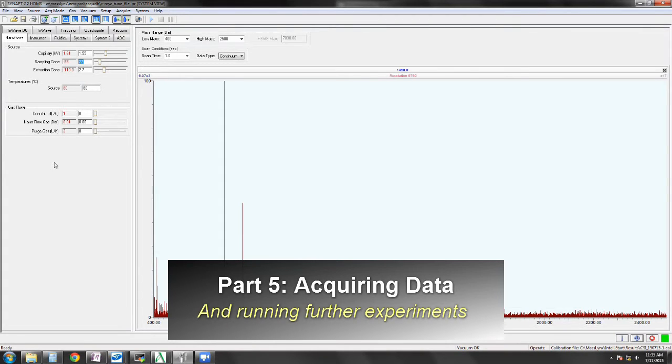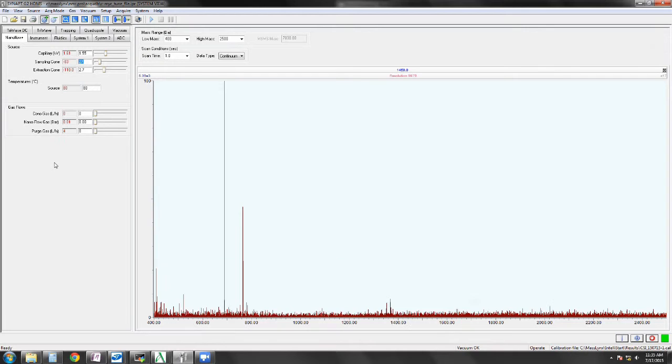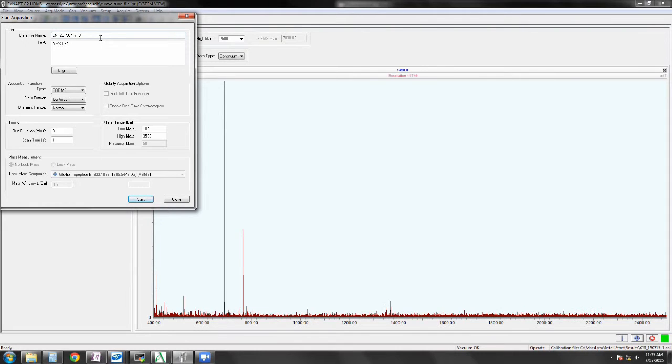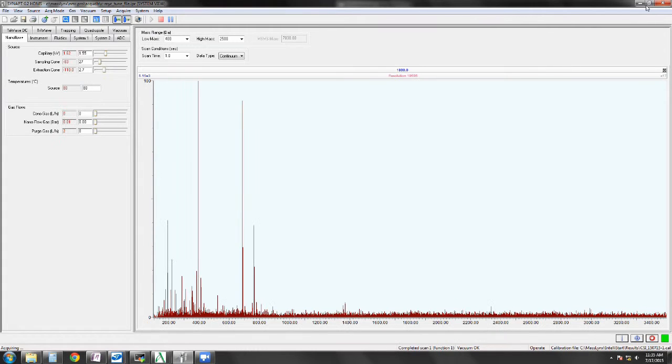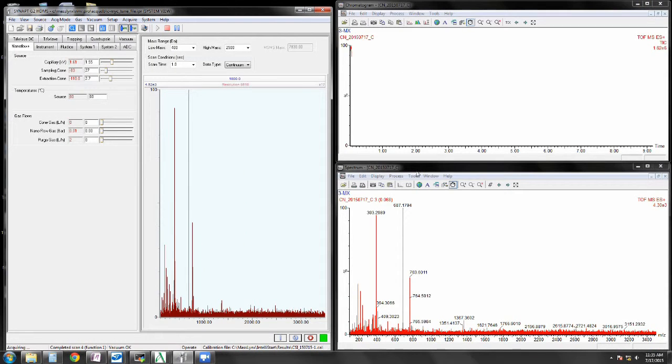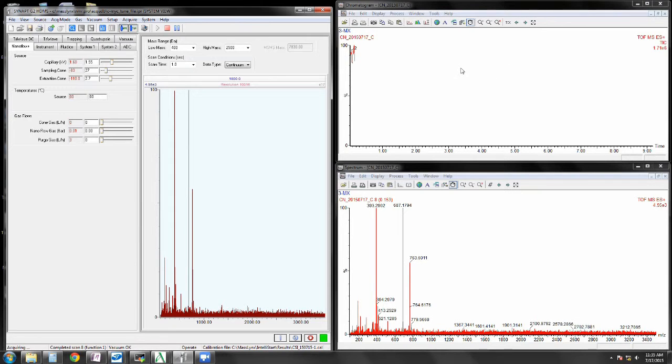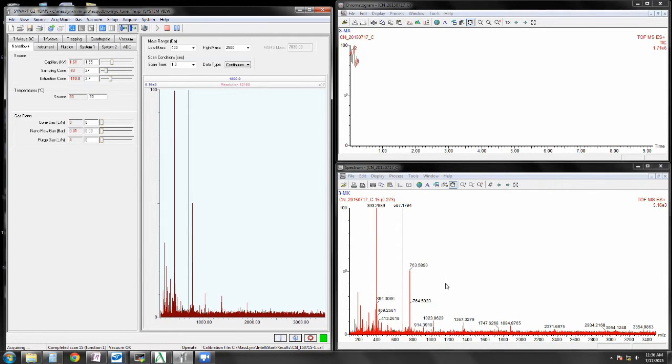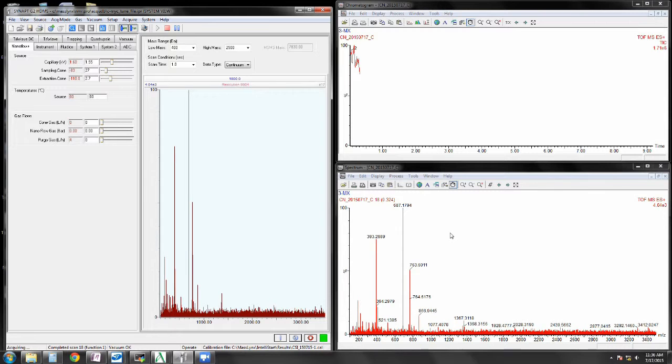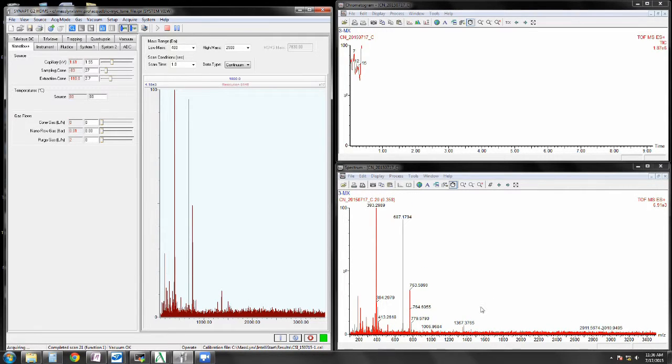I'm going to show you how to do some simple experiments that you might do on your instrumentation. Start off with acquiring data. For these Waters instruments, there's usually a button that says acquire somewhere near the top. And we're going to name our sample using initials and the date, and then either a number or a letter. This helps for finding your data later on. And we can label what our sample is in the text box and start acquiring. Whereas before we had signal on the point detector, we're now going to be acquiring on the TOF. And we can see this on the chromatogram and the spectrum. The chromatogram is showing what we call the total ion count, which is the ion count of every ion hitting the detector. And the spectrum is what's occurring every second on the TOF. We can add together several scans to get better signal-to-noise ratio to bring out low intensity signals.